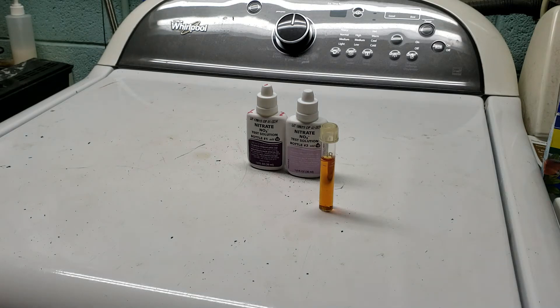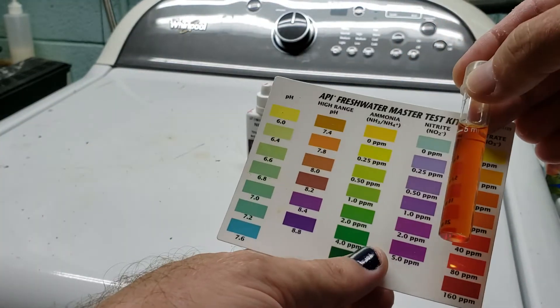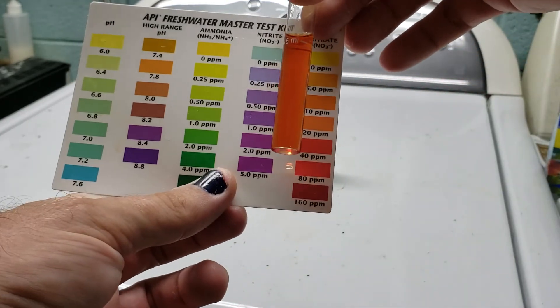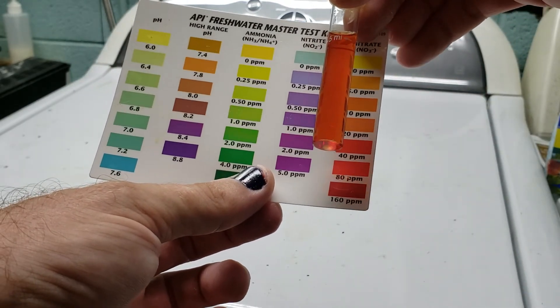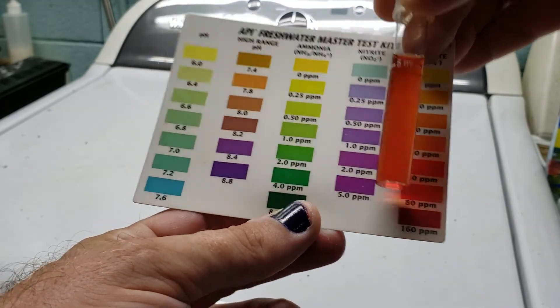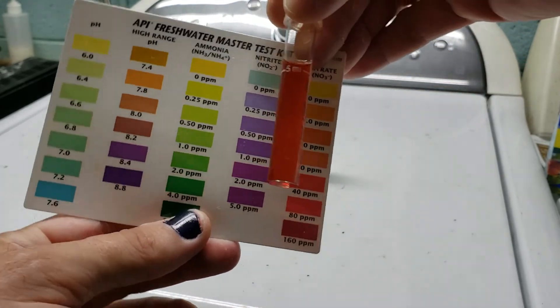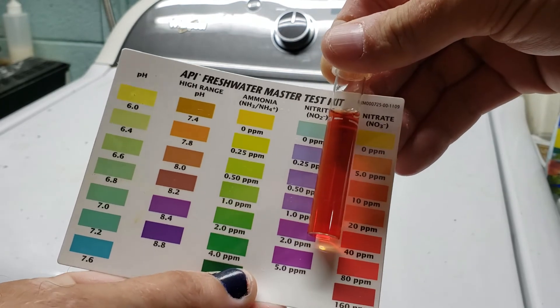You let it sit for five minutes and then come back and check. You can already see it changing color rapidly, so we're going to have a nice bright red vial in about five minutes. To read the color, get yourself under some decent high-quality light and hold the vial in front of the white strip between the colors, about a half inch away from the paper — roughly a finger's width. Allow light to pass behind it and look at the color of the vial that way.